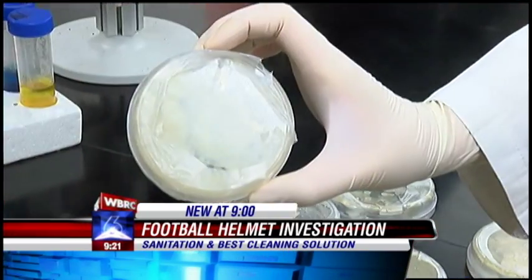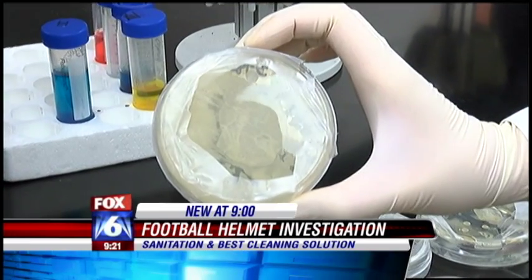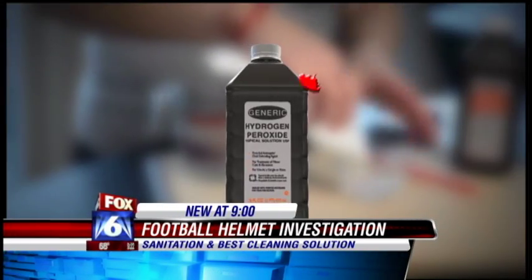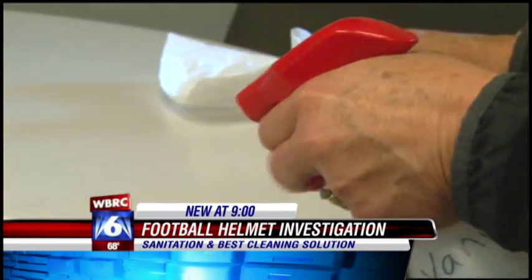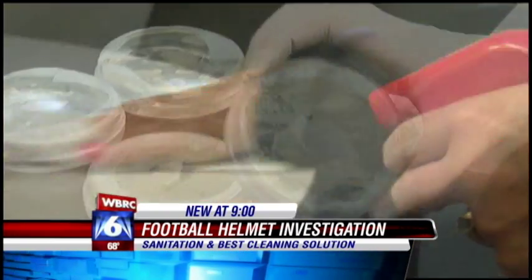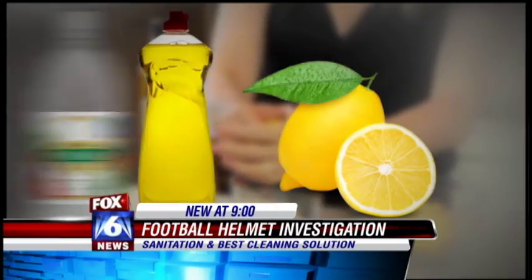So what's the best way to clean a helmet? We put a couple of household cleaners to the test. If you look at this plate, some of the bacteria is growing just right on top of the hydrogen peroxide. It's safe to say that hydrogen peroxide was the least effective. Next, we tried a homemade cleaner made of lemon juice, dish soap and vinegar. It was relatively effective on some, but it wasn't as effective as we were kind of hoping.